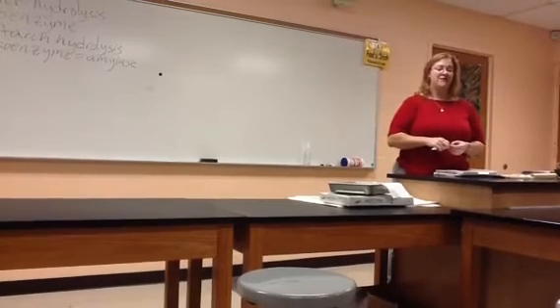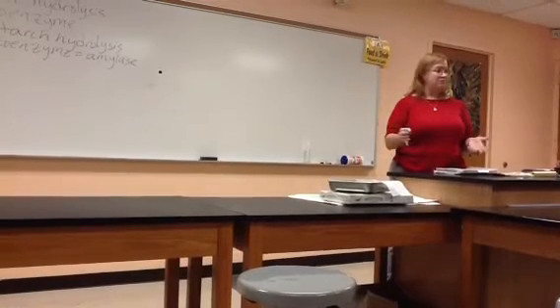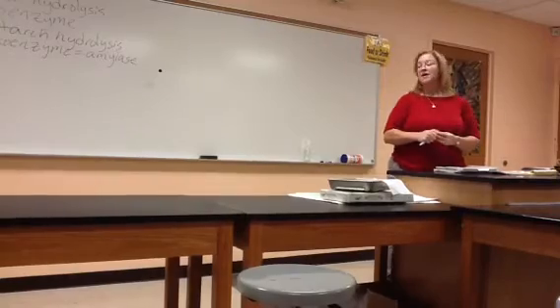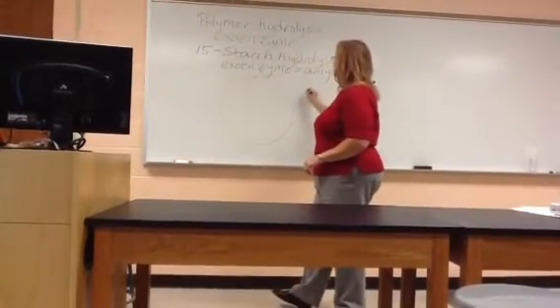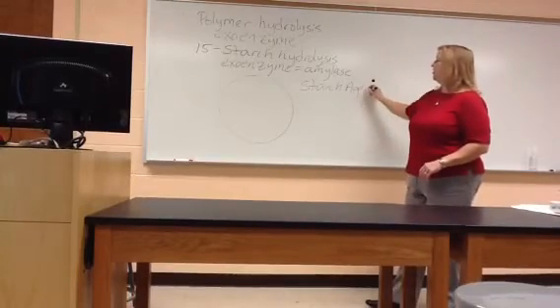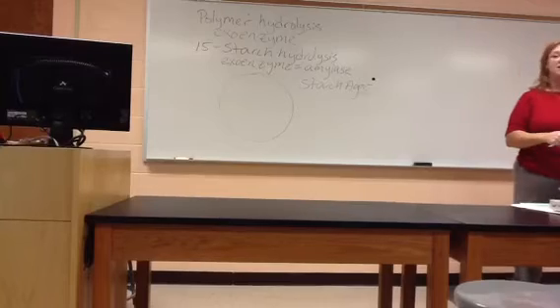Because again, in real life, you've got an unknown patient sample. We're just trying to get an idea of what they eat, what waste products they make, and this is just the first test we're going to do. So the way we're going to find out whether they make amylase or not is we're going to put them on a petri dish that contains starch agar. It's basically just nutrient agar that we've added some starch to, like cornstarch or potato starch, mixed in with the agar.